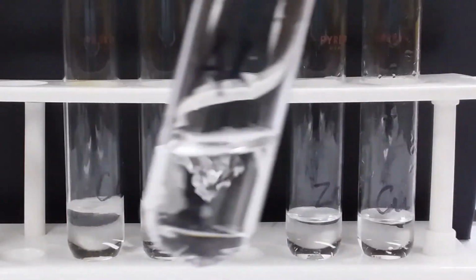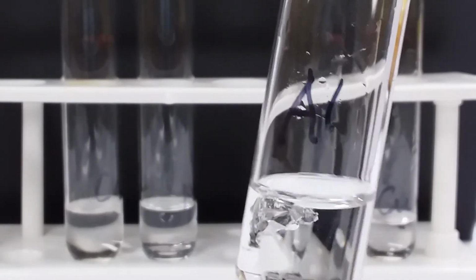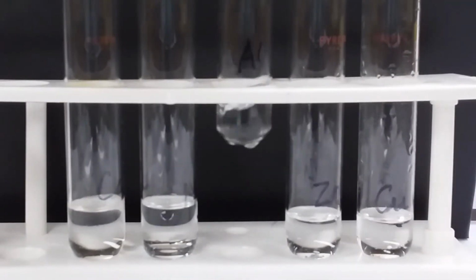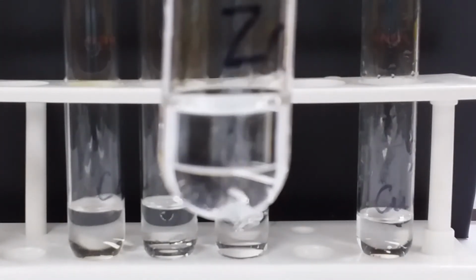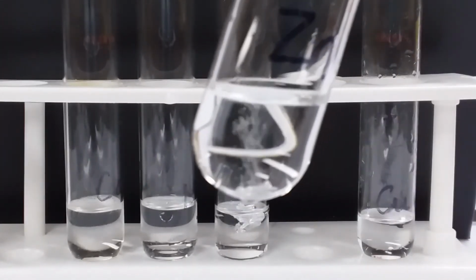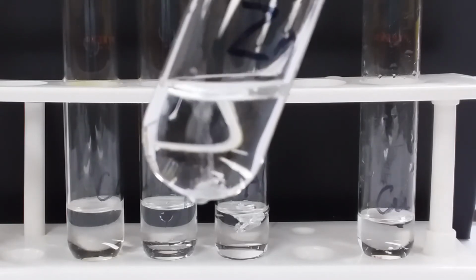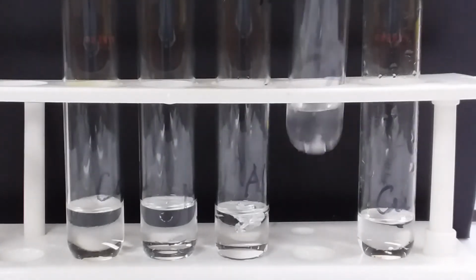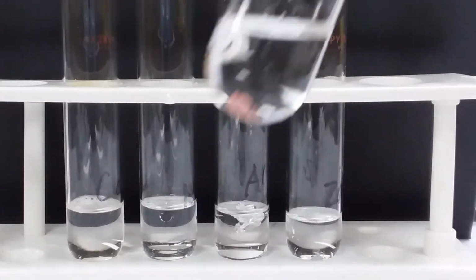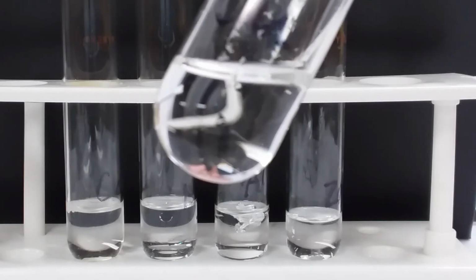Our aluminum still holding on. Our zinc, you should be able to see the bubbles in the zinc. And copper, we're not seeing any reaction at all.